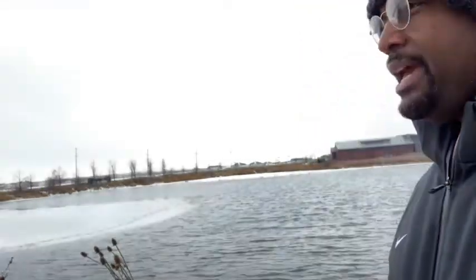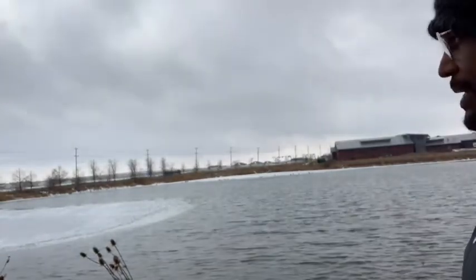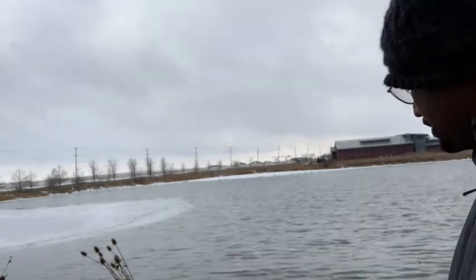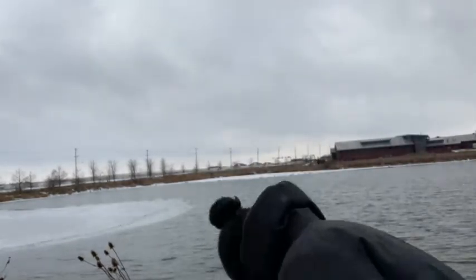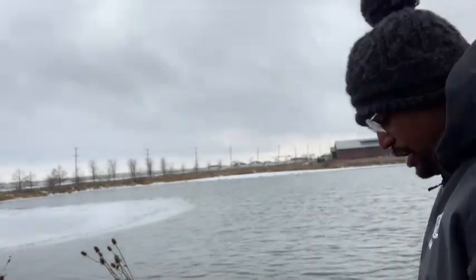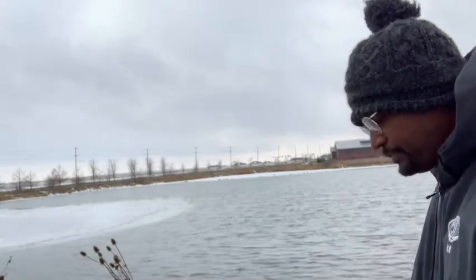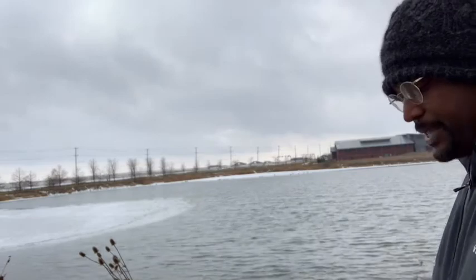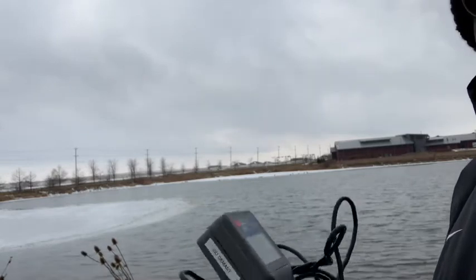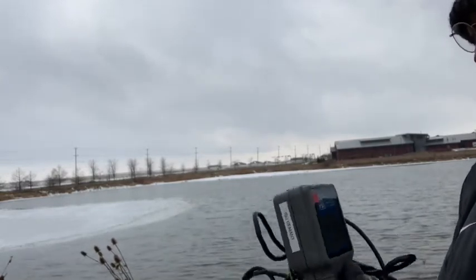And so to determine how good this water quality is, we would have to run tests on temperature. But it's not just temperature, but it's change in temperature between 2 places on the lake. So essentially what I would do is I would use a thermometer, which I have in my instruments here. Here I have a water quality meter. It's called a YSI water quality meter. And one of the things it measures is the temperature of, say, the water.